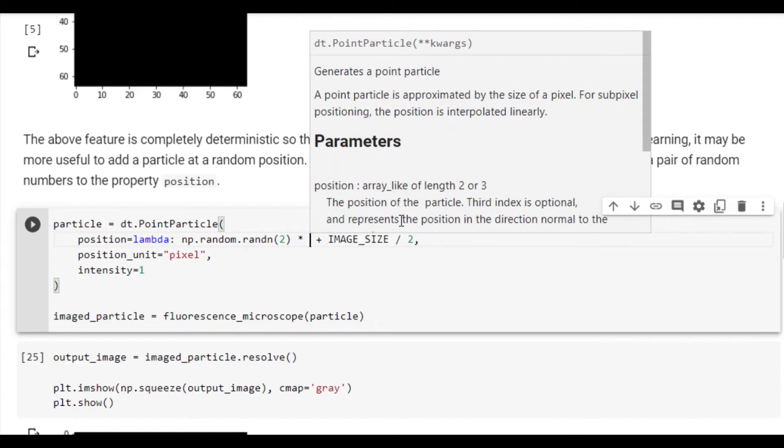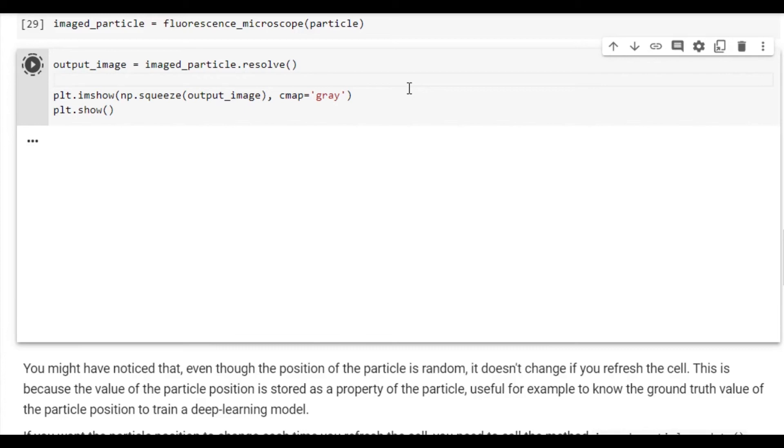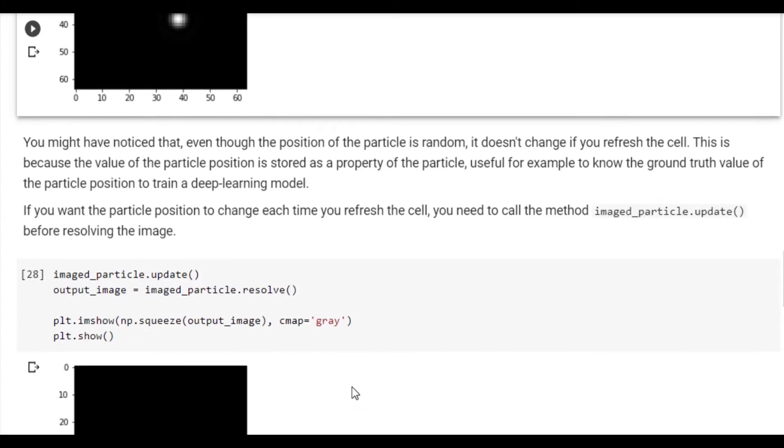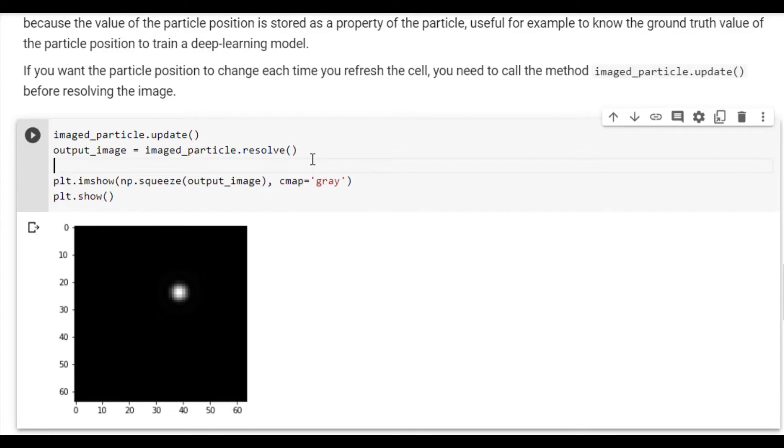Let's go back and increase the standard deviation of the normal distribution a little bit. You will now find, as expected, that the particle is positioned close to the center of the image. You will also find that even if we run the same cell multiple times, we get the same position. Recall that we have to call .update for the feature to grab a new position. As such, we will call image_particle.update, we will resolve an output and show it. You will now find that the position of the particle updates each time we run the cell.